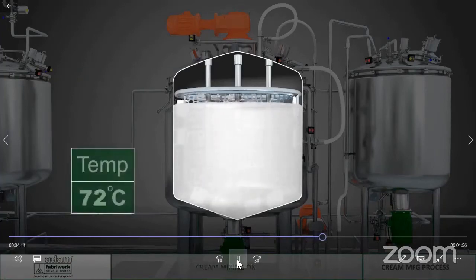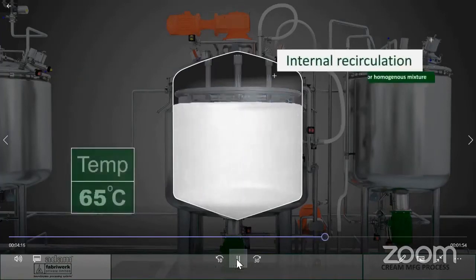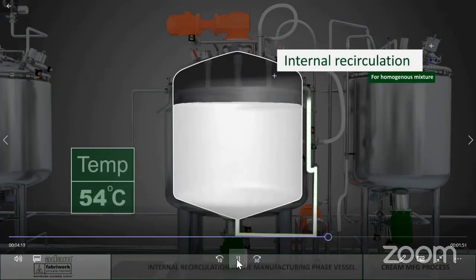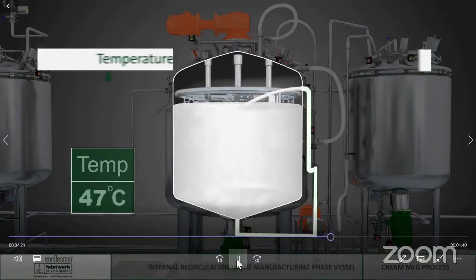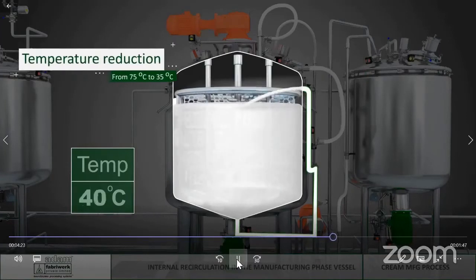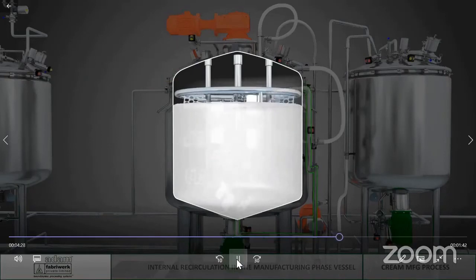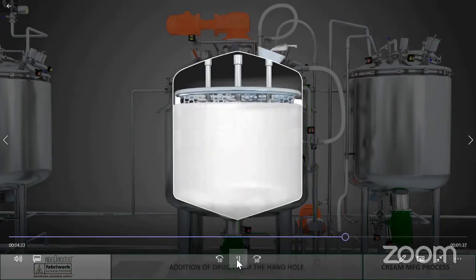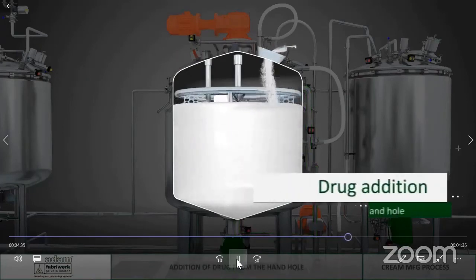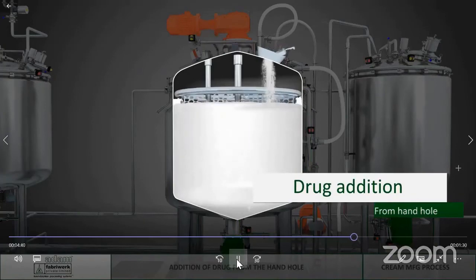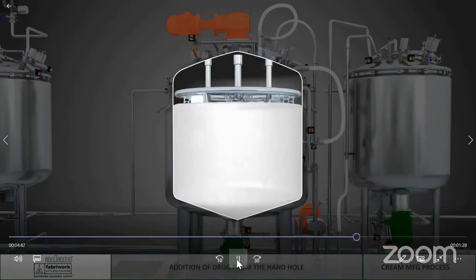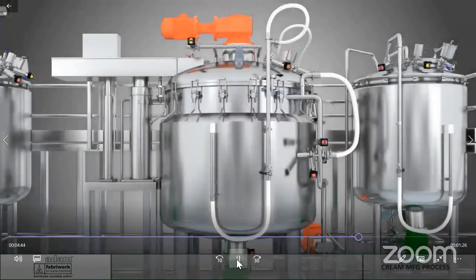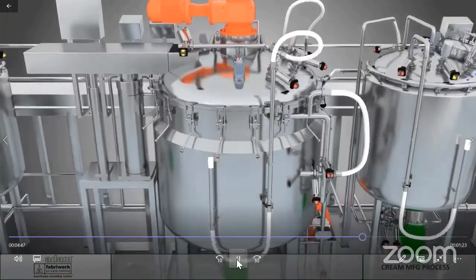The wax and water is moving now at 75 degrees and now being cooled. It also goes through an internal recirculation where temperature is reduced from 75 to 35 or processed temperature as per the batch. This is where the emulsion is formed by combining the wax and the water. The drug, API, color, or perfume as the case may be, is added from the top.